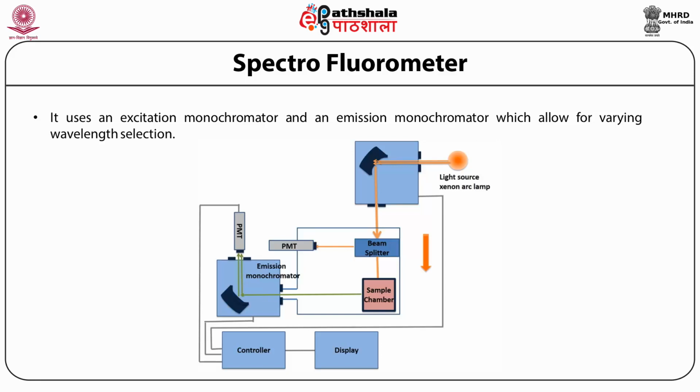There is also a disadvantage of spectrofluorometer that it is several times as costly as filter fluorometer and can only provide moderate sensitivity and specificity. And the block diagram for the spectrofluorometer is shown in the figure.